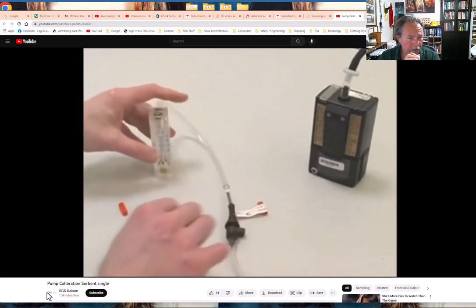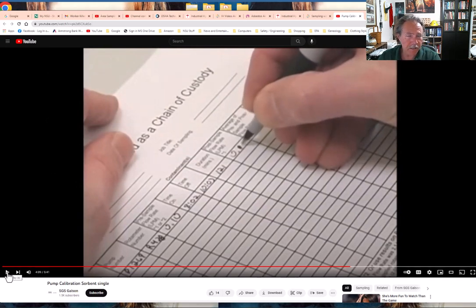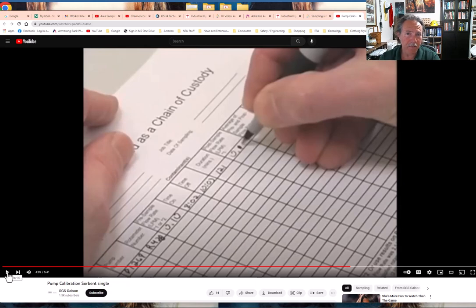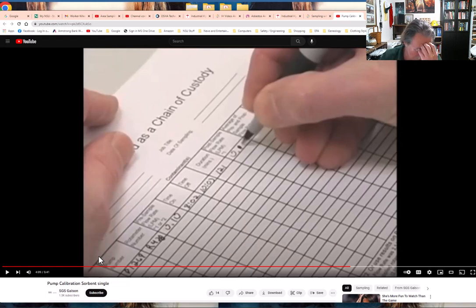Let me point something out here: just record the flow rate on the pump calibration sheet. You've seen two tubes in this video — the first was the calibration tube, the second was the sampling tube. For post calibration, you use the tube from pre-calibration. The tubes you actually use to collect samples are not used in the calibration process. I'm hitting hard on calibration because it's really important to get it right if we're going to have valid sampling results.